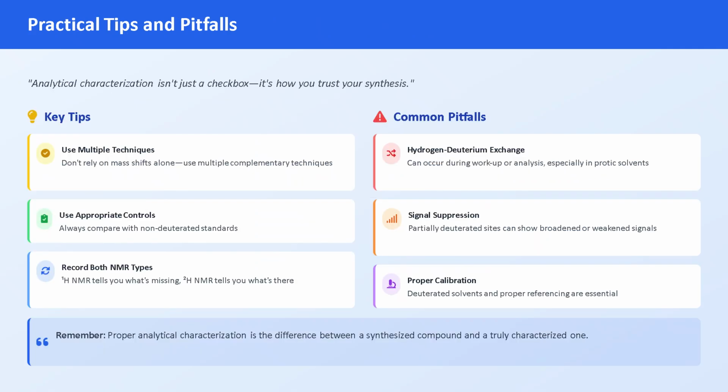Let's bring the pieces together with toluene-d₈. NMR shows no 1H signals in the aromatic region, confirming substitution at those sites. 2H NMR shows resonances where those protons used to be. On the MS side, the molecular ion shifts up by +8 Daltons.